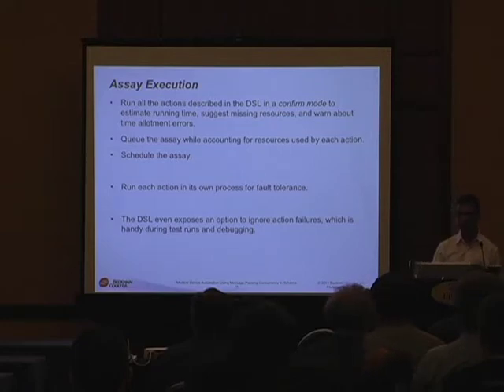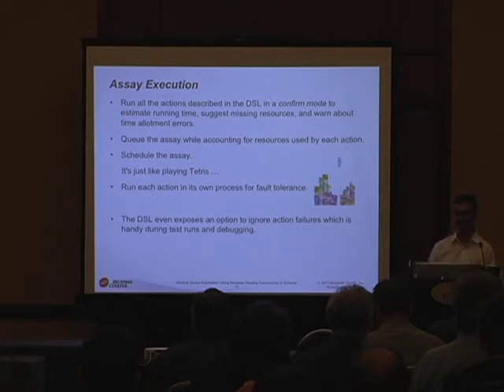And the scheduling is actually not that hard in this case because we don't move previously scheduled devices. It's essentially like playing Tetris. You just have existing resources being used and you find the best slot and you slide it in there. Each action, which is basically a set of steps, like motor moves or pipetting liquid and stuff like that, is run in its own process.